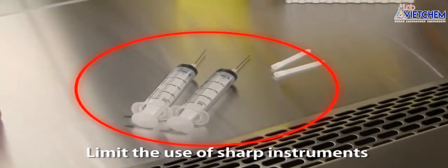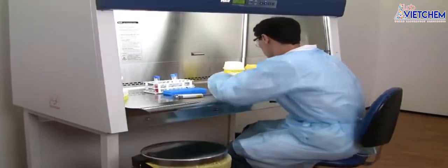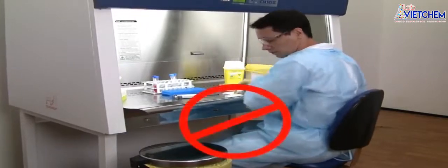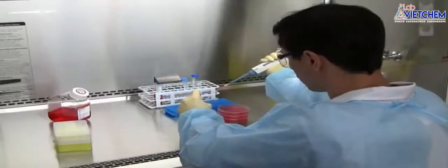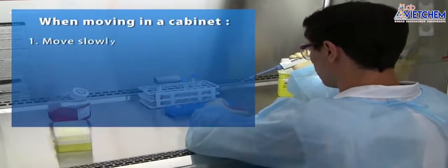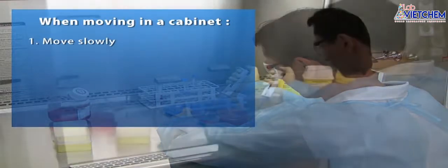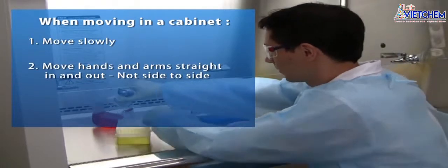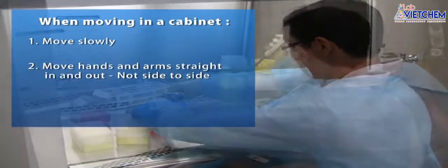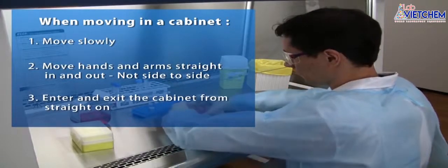Limit the use of sharp instruments, particularly needles and syringes, in the biosafety cabinet. Avoid moving your hands in and out of the biosafety cabinet. When working in the biosafety cabinet, use slow and deliberate movements. Avoid side-to-side arm movements as much as possible. Enter and exit the cabinet from straight on.